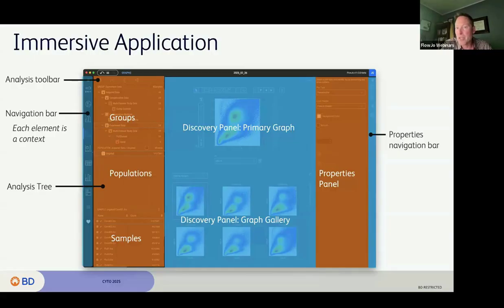It is also the selection tool used throughout the whole program from almost anything. If you want to run something or point to something or load something on a population and a sample, you just do it directly from the analysis hierarchy. We've done away with any kind of window or drop-down menu that requires selecting a population or a sample in some way. So keep that in mind when you're trying 11. The hierarchy is the primary way to do any kind of population selection. If you're looking to change the view of a particular population, try clicking it in the hierarchy.